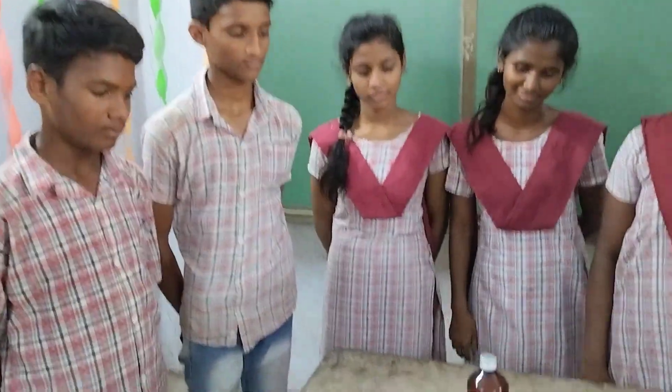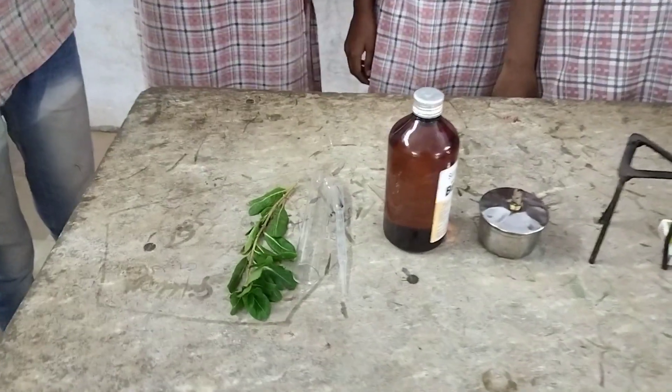Hello all, let us learn the experiment that proves the presence of starch in leaves.